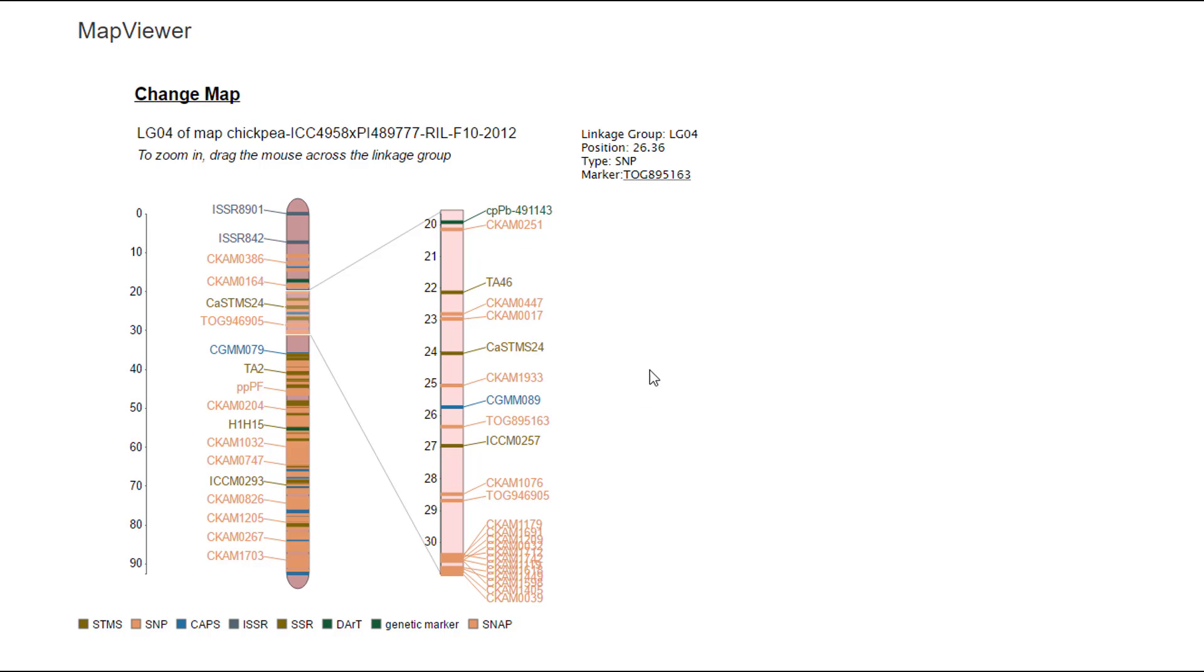Once you get a region that you like, to view more information about the markers you can hover over the marker name and see the information up in the upper right, or you can click on the marker and be taken to the Marker Overview page.